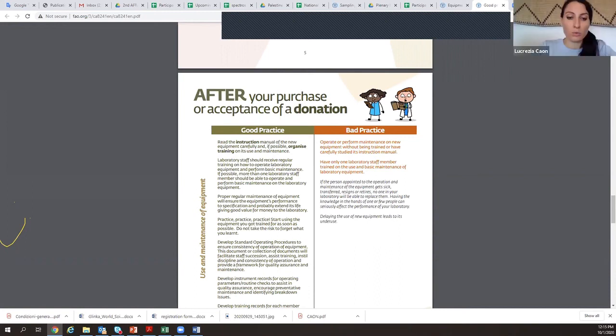Well, what we are asking in our procurement for some types of equipment, the one that is most valuable, is a kind of extension of the warranty for usually a couple of years. Not all vendors offer this, but we try to get it. But I would say that there is not any rules. I can ask the procurement unit better for this information.